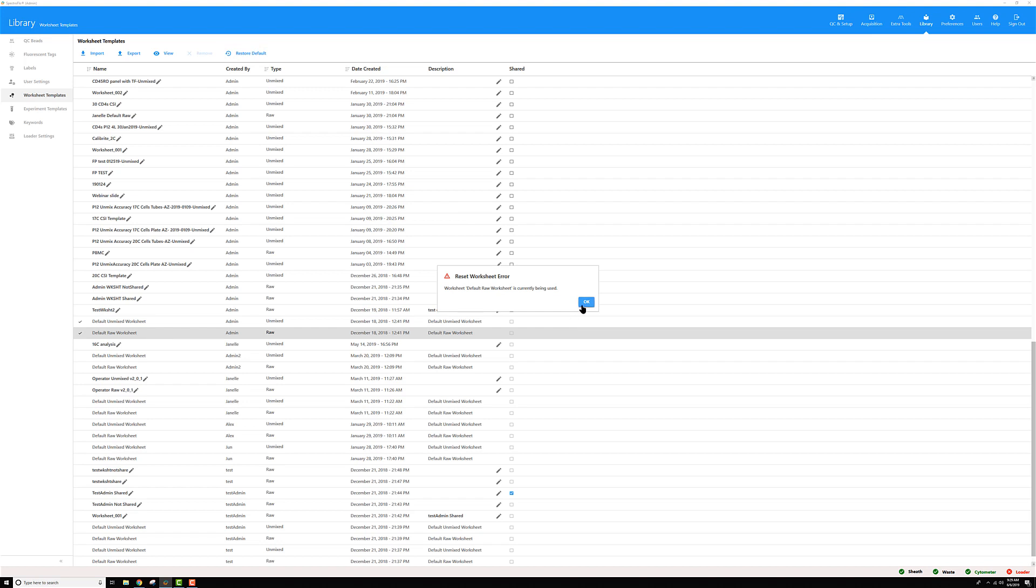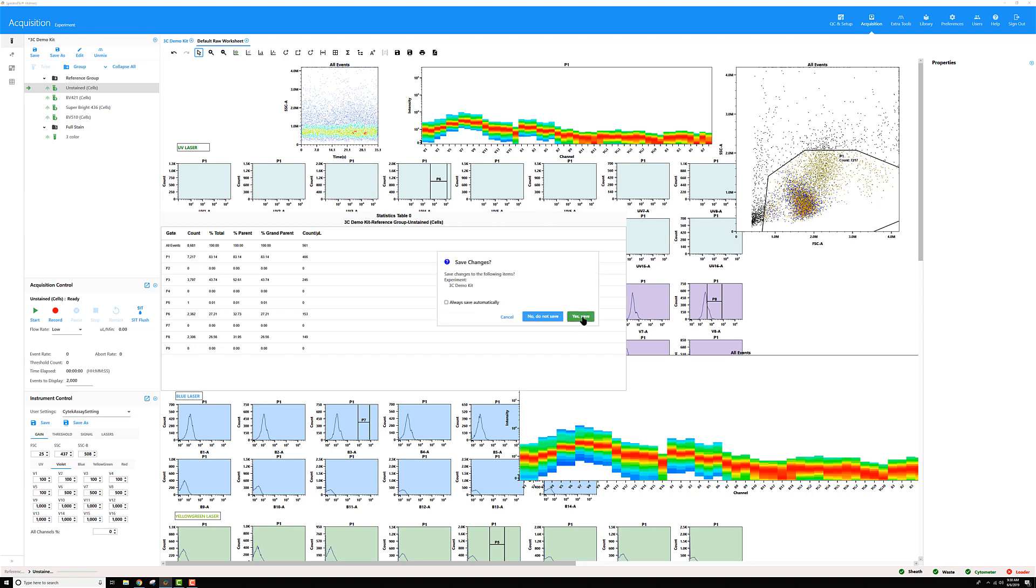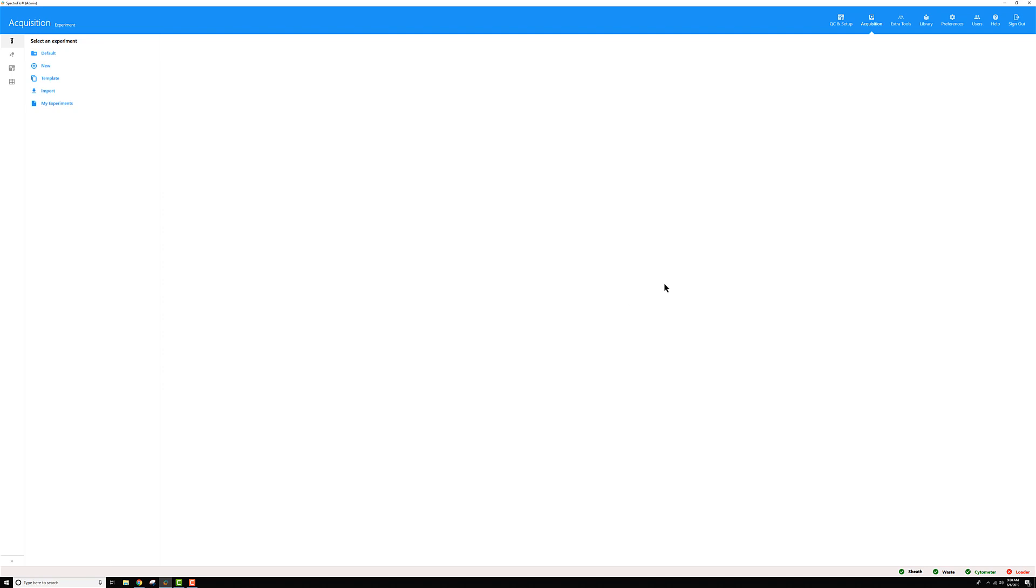Now you might get this error if the experiment is open using that worksheet, in which case you can't reset it. So let's close that out and go back to my acquisition page and close the experiment I was in. I'll go ahead and save my changes.